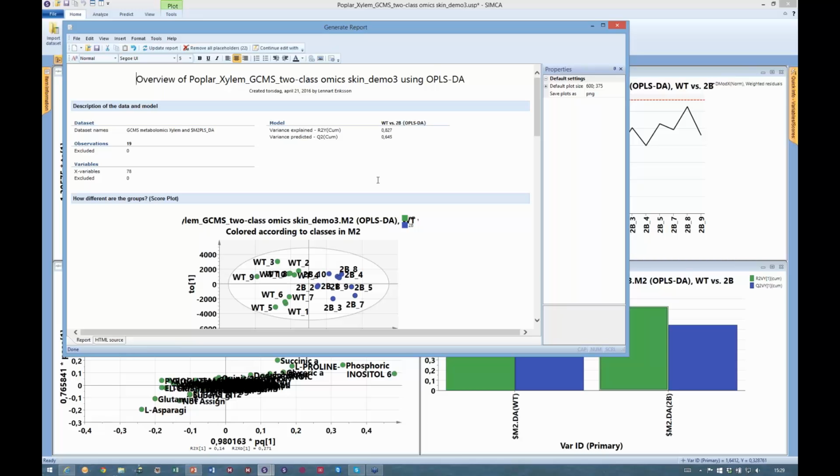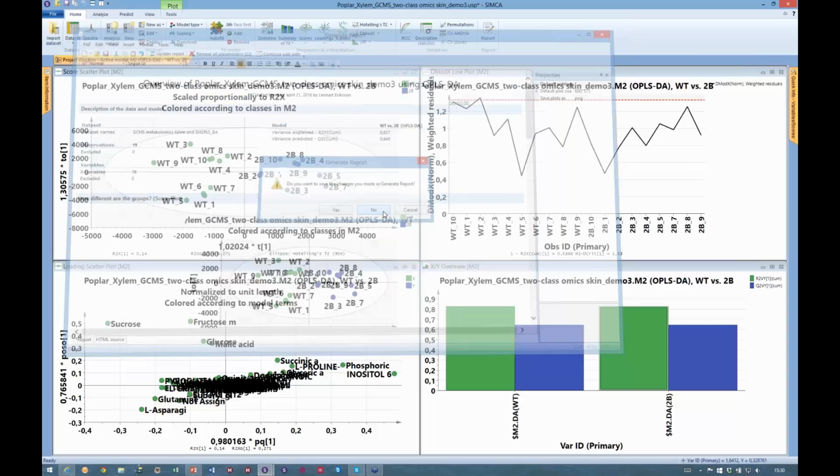The placeholder can encode a certain plot, a certain table. It can also encode boilerplate text that is extracted from our documentation in our user guides and then put into the report. And you can start to experiment with these placeholders, change their order and add other placeholders, and in that way modify the report template to become your preferred report template. But we have other webinars on that certain topic. So I will now close this report and I will not save any changes.